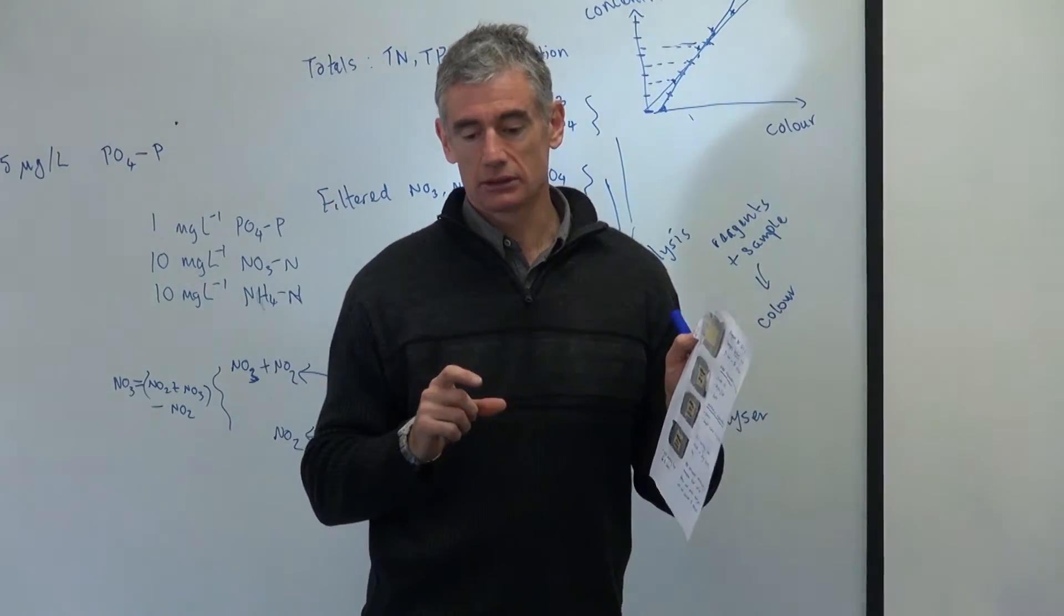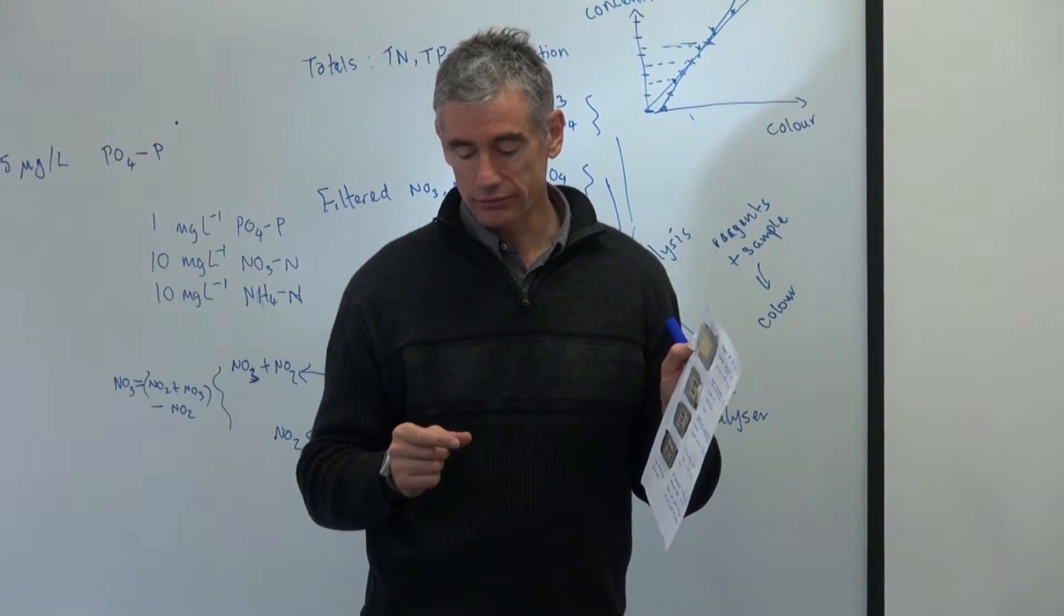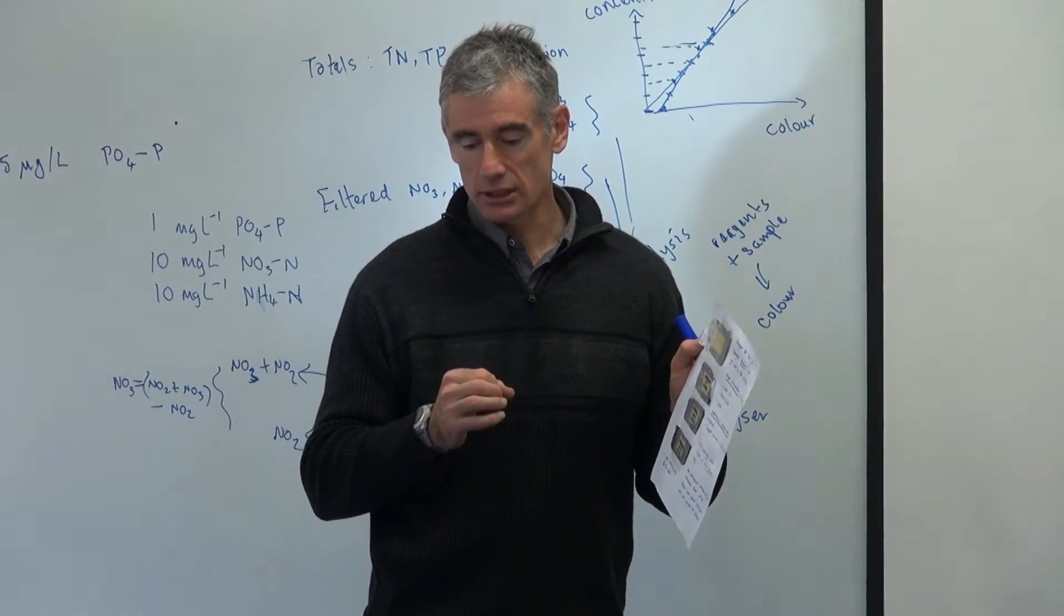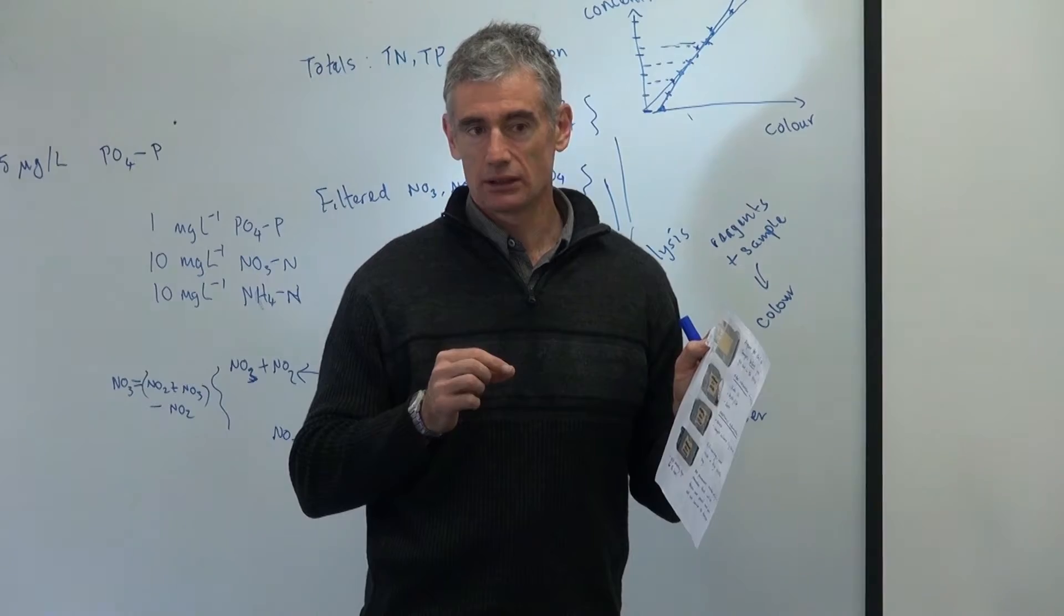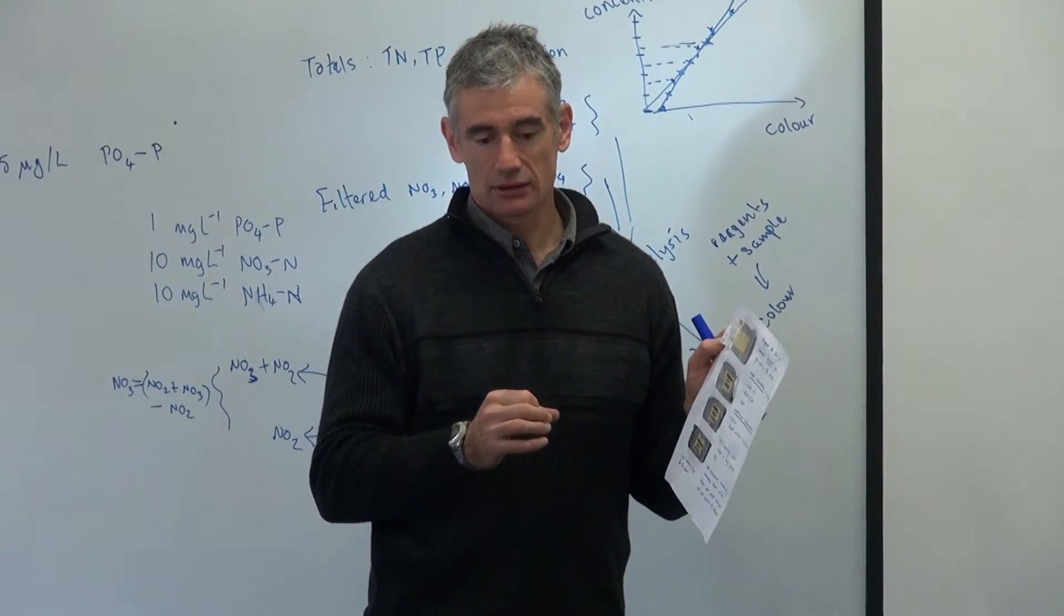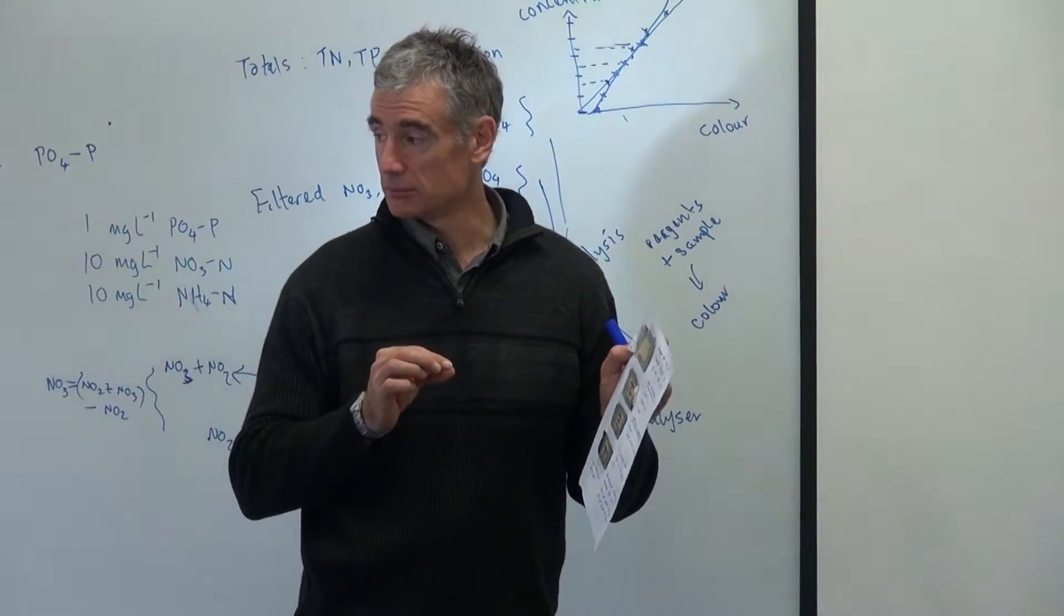The filter is folded, then folded in half, with the upper side on the inside as you make the fold. In other words, the green side is folded internally.